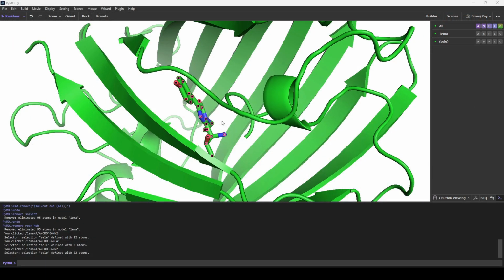Let's explore the different changes we can make to our objects. Next to each object entry is a series of buttons. The action, labeled A, shows adjustments that can be made to the camera in the viewport and edits to the object. A very important setting in this submenu is the rename function. To use this, click into A and then click Rename Selection.